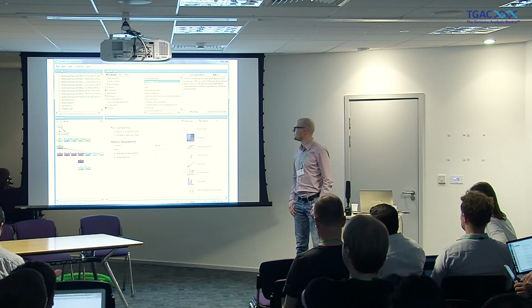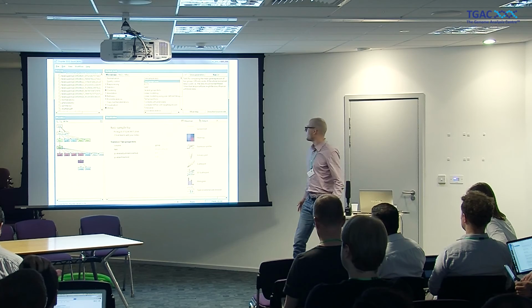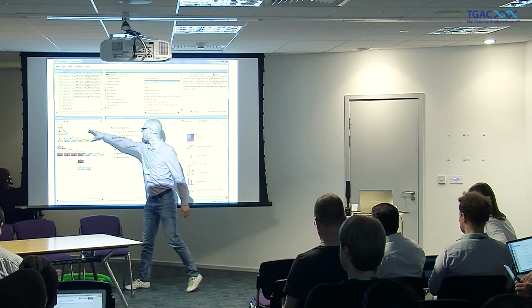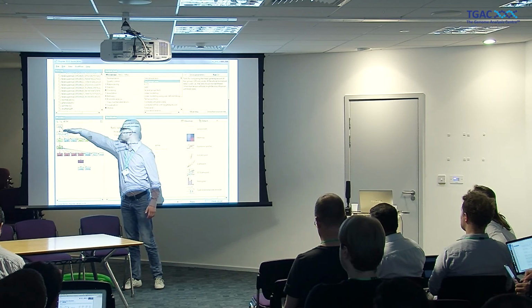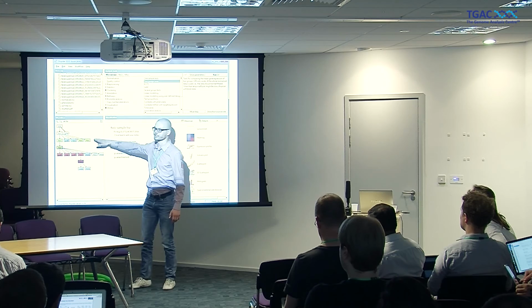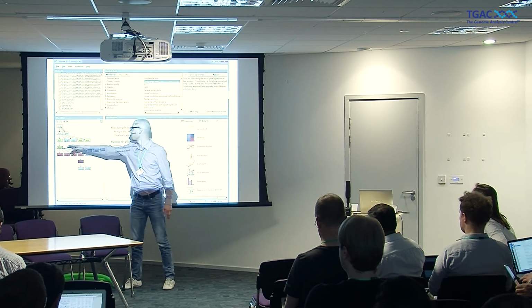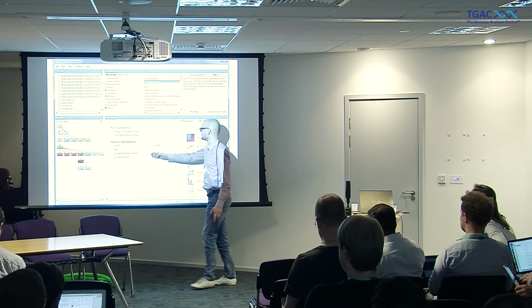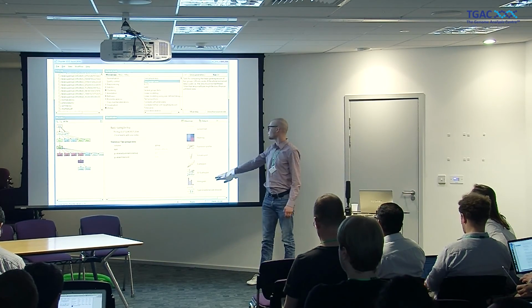Let's continue. So this is our user interface, a little bit old school, made in Java. Here is the workflow. This is the raw data, and then there are analysis steps for the data sets that each step has produced. And when you select the data sets, then you see the parameters that were used and then the visualization options for those.